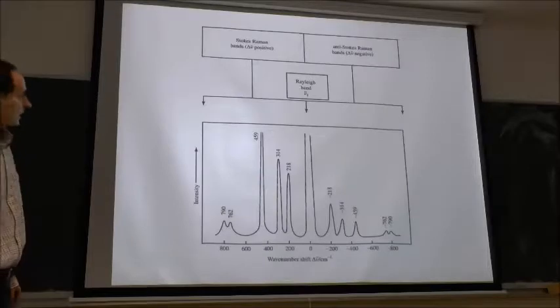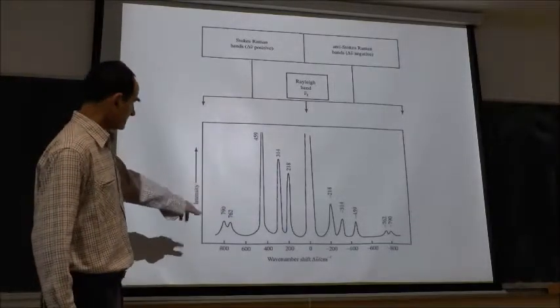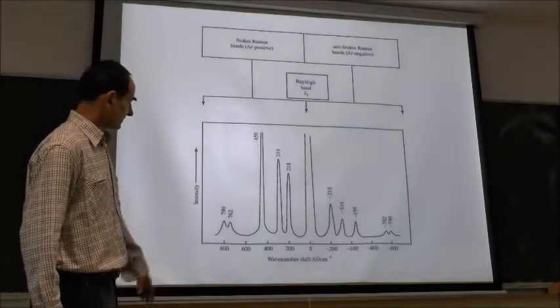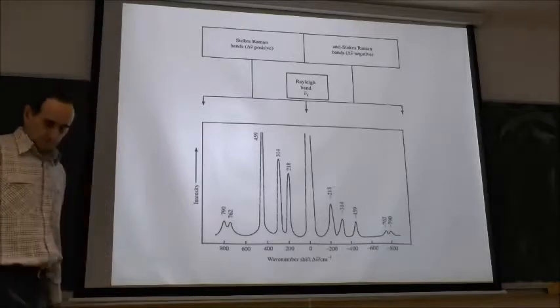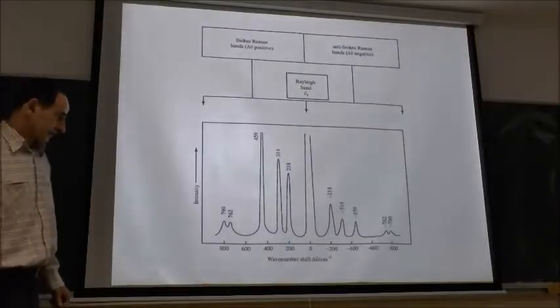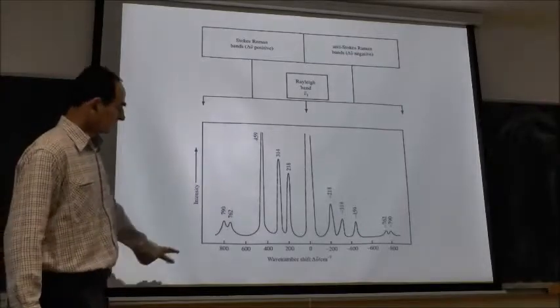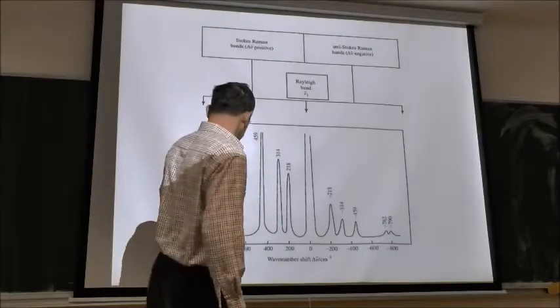So how would that look? This is the spectrum of the Stokes, Rayleigh and also anti-Stokes radiation. I would stress, for convenience, that the IUPAC recommendation, the International Union for Pure and Applied Chemistry, recommends plotting the Raman spectrum that way, so the frequency increases to the left.